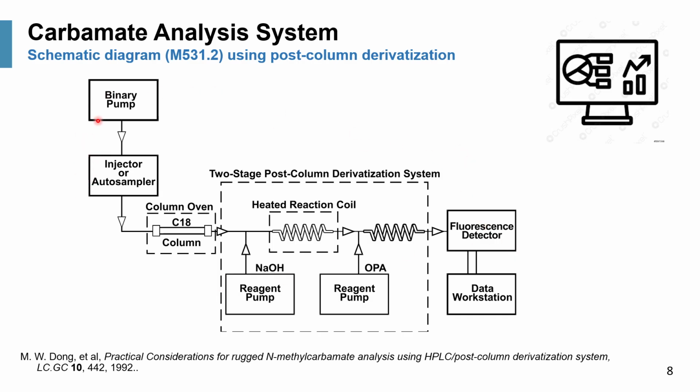So using a binary pump injection, column oven, and two reagent pumps with heated reaction coils to give you a post-column derivatization workstation. So this particular diagram came from a publication in 1992.